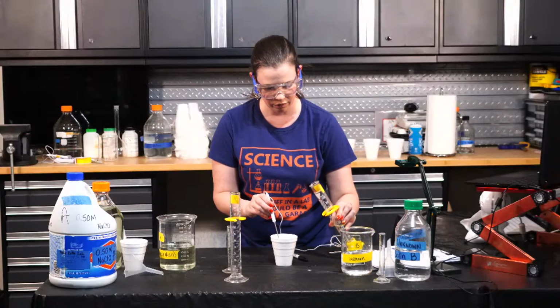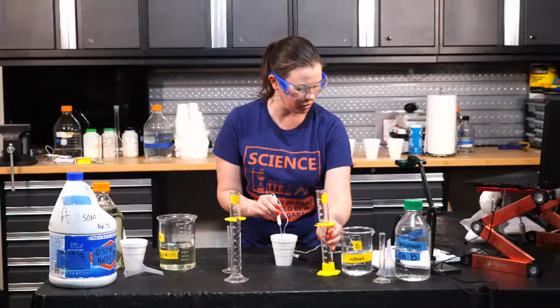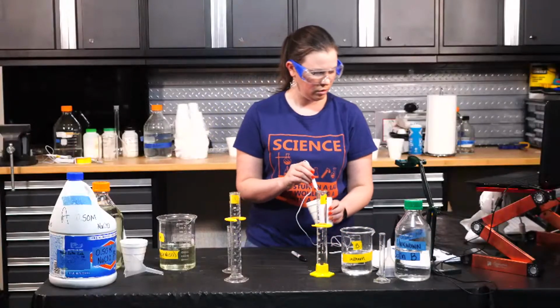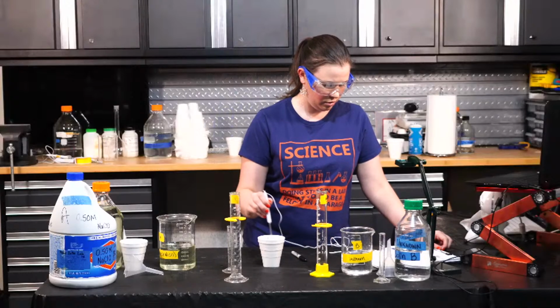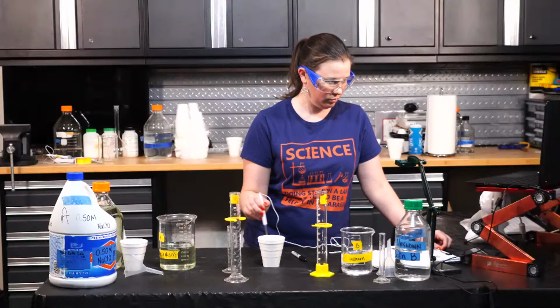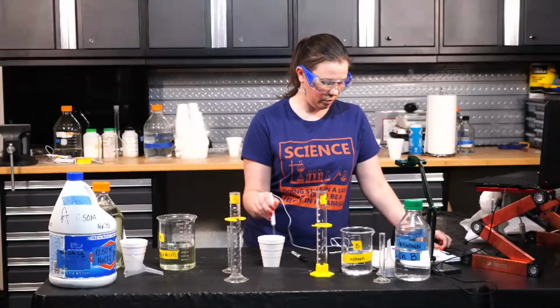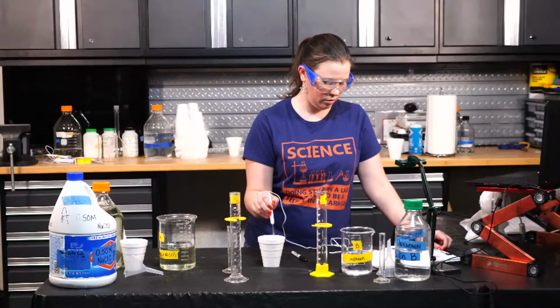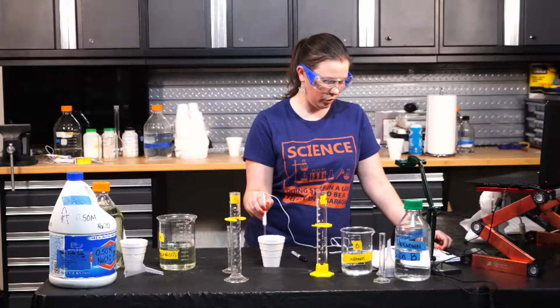So then we're going to add our 45 milliliters. All right, and we got 21.2, 21.3. Mix it. 21.4. 21.4. Still 21.4. So I believe that is our final temperature for level 1, 21.4 degrees Celsius.